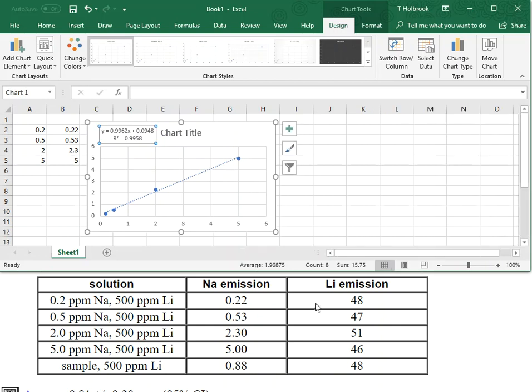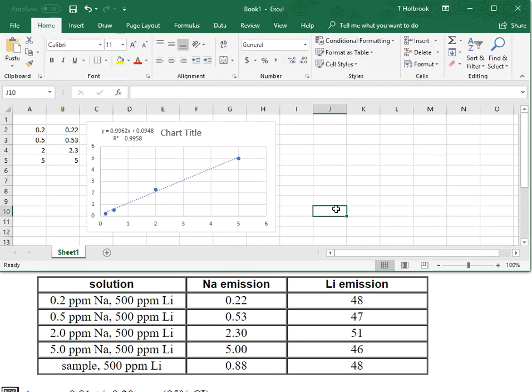All right, so there we go. The first part of this problem is now completed. It wanted me to treat this like any old calibration step, and this is what I did. I plotted the concentration on the x-axis, and I plotted the signal on the y-axis. I did a linear regression curve, and looking at this, it looks pretty good. 0.9958, right? I did a really good job preparing the standards if these are the signals that I received from them.